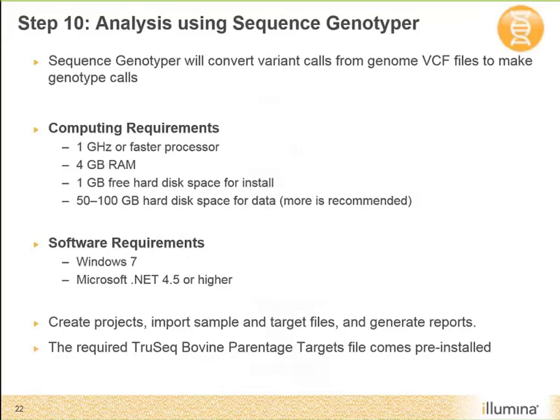Sequence Genotyper allows you the capability of creating different projects, importing samples and target files, and generating reports. The required TruSeq Bovine Parentage panel target file already comes pre-installed within Sequence Genotyper, so there's no need to upload a different target file.